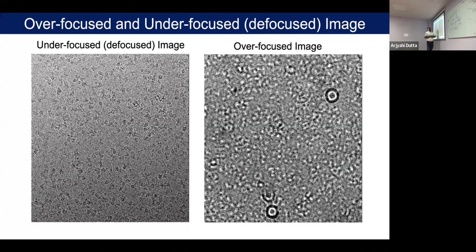That is the reason, especially for electron microscopy, if you don't collect your data properly, the same thing can appear in a different way. If you change your defocus, and you use under focus and then image the same thing at over focus, your sample will look completely different. That is the reason we have to be very careful when we collect the data.